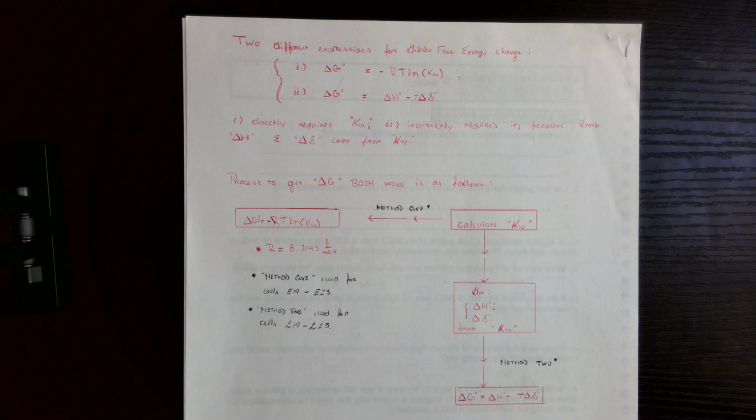I'll be honest and say that generally people don't seem to get very good results for this lab. The most recent group, a couple people actually did really well, but in general they don't tend to work out very well. So I say that to say this: when you do your scatter plot for this lab, don't freak out because the straight-line fit is terrible, like the correlation's weak. Just roll with it. It's going to be that way anyway, and I'll discuss maybe why that is in a minute, but just don't freak out over it. You're not going to get a very good fit. It's not going to happen. Not with this data anyway.